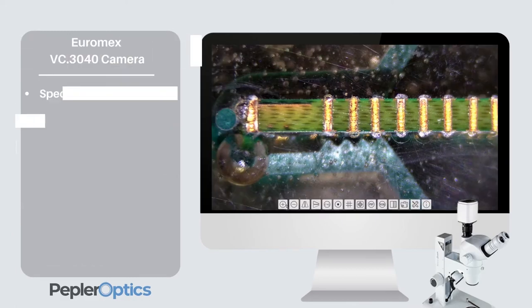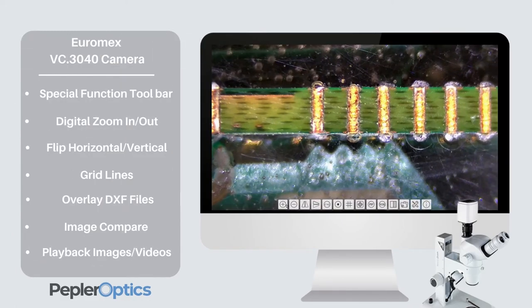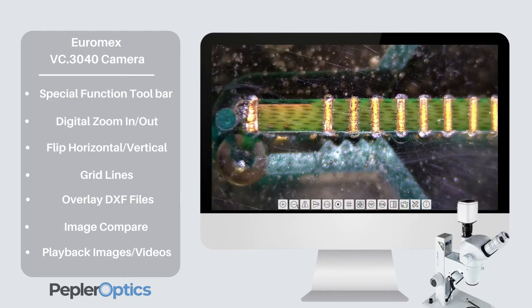The toolbar at the bottom of the screen provides quick access to other functions including digital zoom, image flipping and compare.